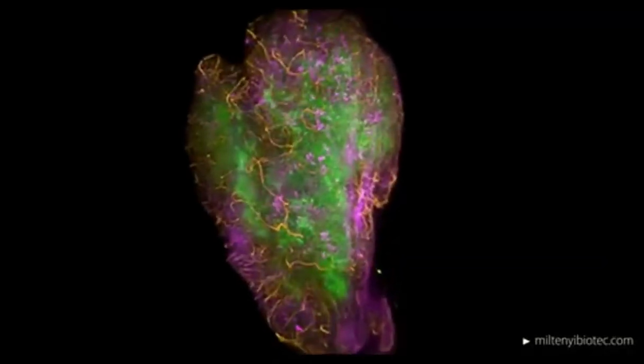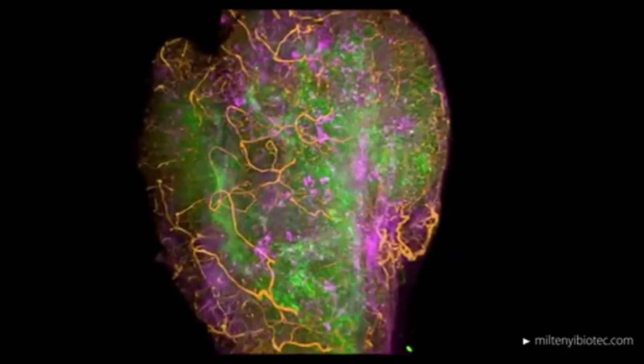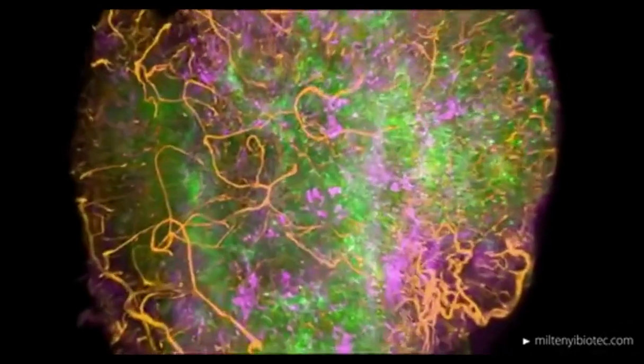This video shows a xenograft of a human pancreatic carcinoma cell line which expresses GFP, along with infiltrating CAR T cells shown in violet. Sample preparation involved whole mount immunolabeling followed by ethyl cinnamate clearing. The 3D data of the tumor were created using the UltraMicroscope 2 light sheet microscope. The CAR T cells were labeled using REA844 clones conjugated with Vio 667, detecting human CD271, with vasculature being seen in orange.